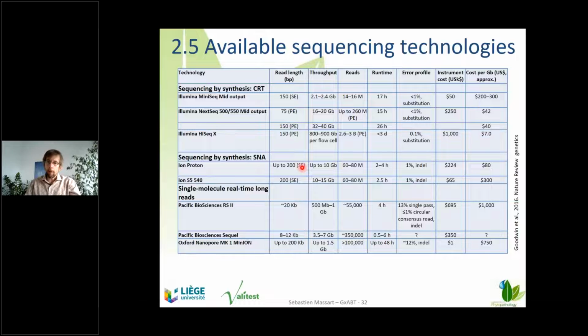Just have a look. A few years ago I gave here some examples that are now more and more outdated, I must admit. It's just to underline that within a single sequencing technology, Illumina, you have plenty of machines. And we will have a look on Monday, once we analyze: if I want to use a technology, how can I design my laboratory? Which tools do I need? Would I need to outsource or not? We will address it on Monday.